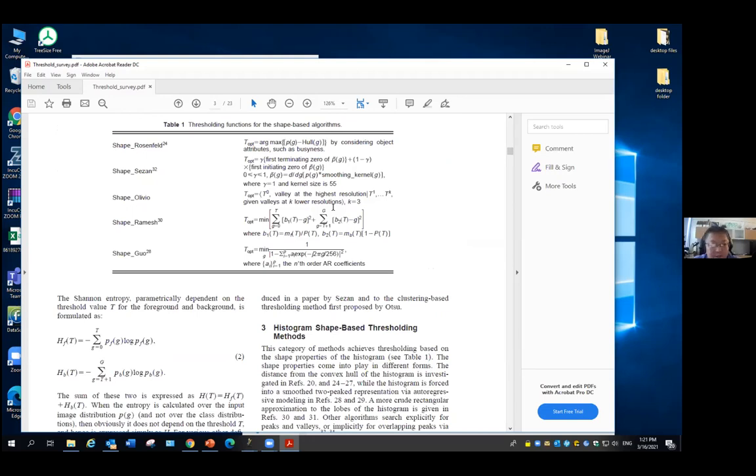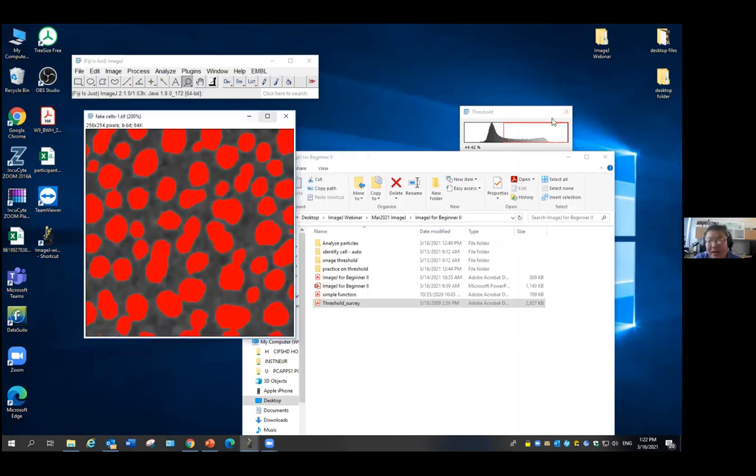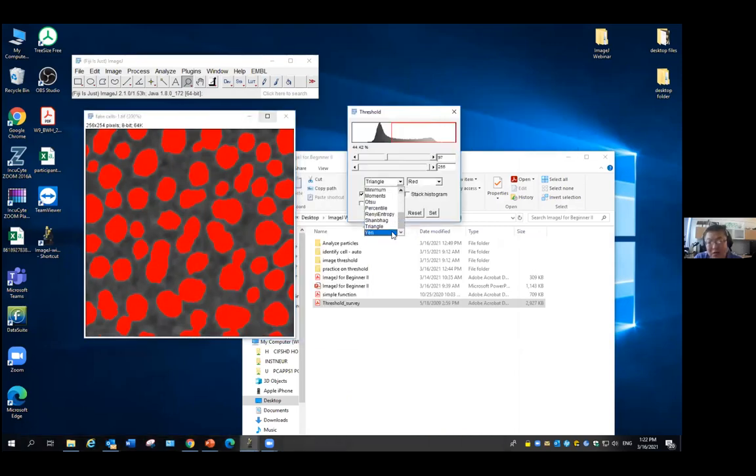We only need the smart people to figure it out. They found a way to do it. My job is to say whether it works for me or not. If you're interested, you can go through it, but I don't say it will be any help. My goal is to look at my image and go through all those options. If I use the percentile, this threshold is 88, so no. Interval, maybe okay. Lee, maybe okay. Actually, Lee is exactly what I choose, so I will use this one. I think this one is good.